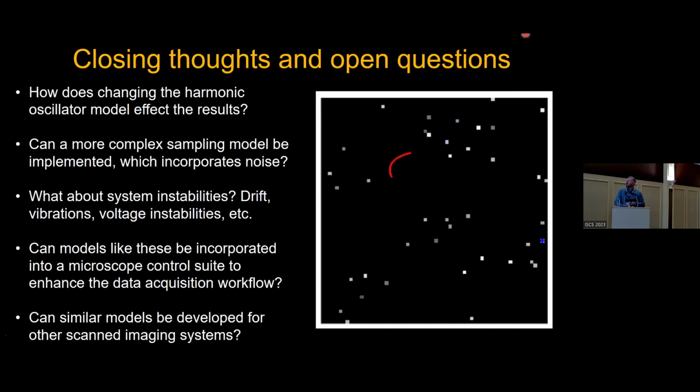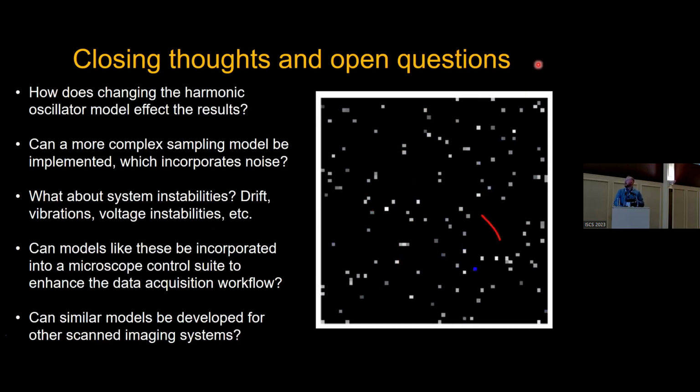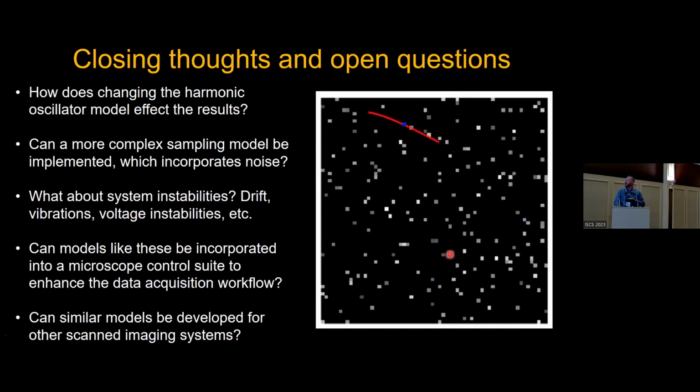So just for some closing thoughts, and just to show you, this is what random scanning would look like in a real STEM. This is why we get noisy images out, because the blue location is the proposed scan coordinate, and that's the beam in red. The beam never approaches the coordinate in any regard.